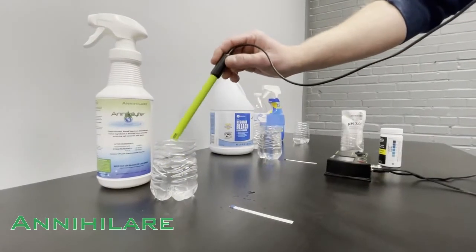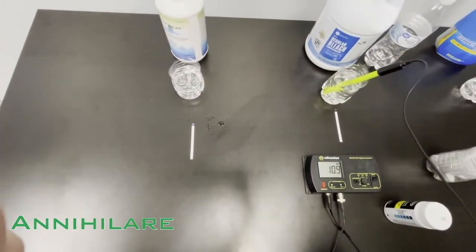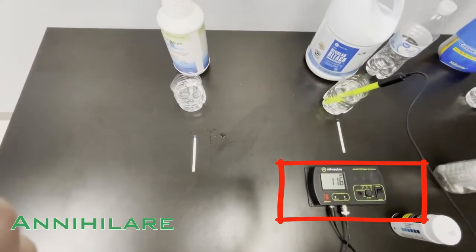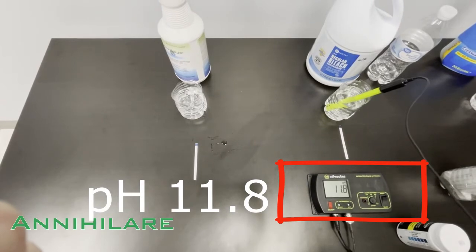Now let's move over to the sodium hypochlorite bleach solution. Watch how the pH just spikes through the roof and it's going to land a little bit south of pH 12.